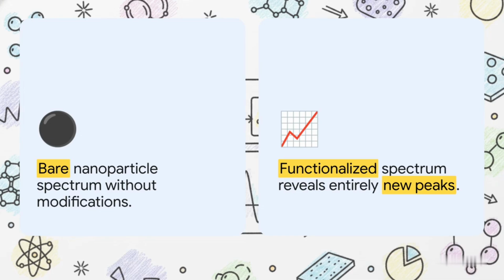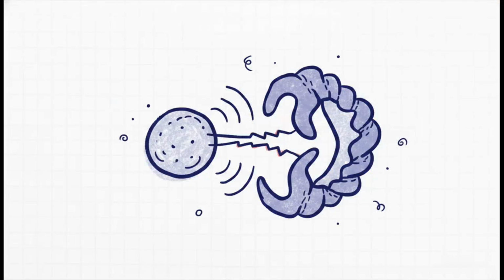You run a spectrum on the bare nanoparticle, right? Then you run a second spectrum on your newly functionalized one. You layer them over each other and you look for entirely new peaks. If your bare particle had 0 carbon-nitrogen bonds, but your attached drug has them, well, if those brand new peaks pop up on the second spectrum, it definitively proves the functionalization worked. Makeover complete. Finally, we have role 4, interaction insights.